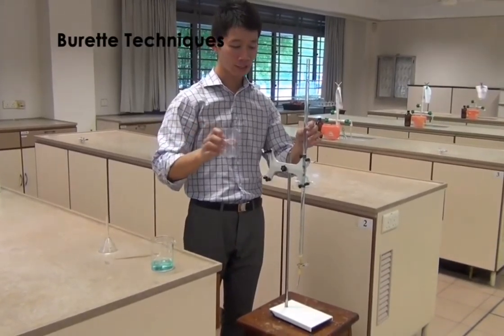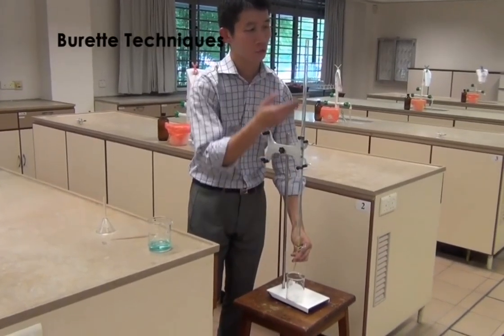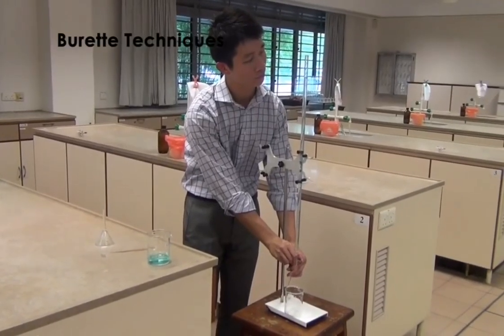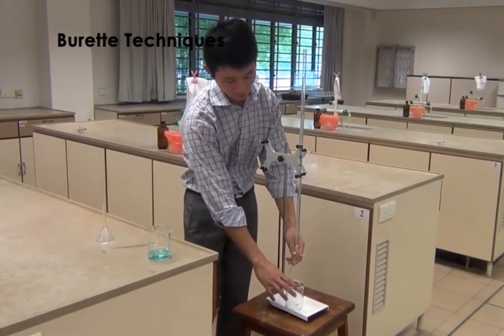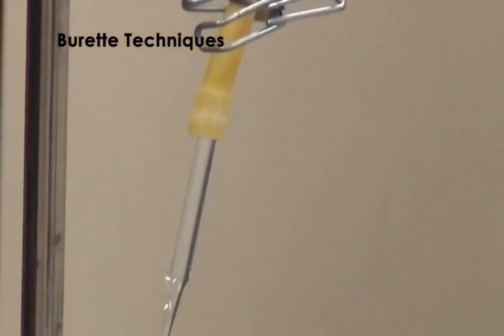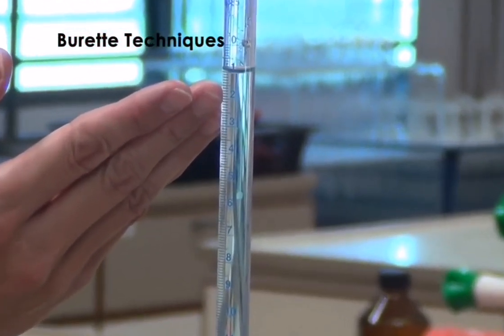Position the waste beaker at the bottom of the burette. Now, open the clip to empty the solution until a marking that you are comfortable to start the titration with. Once you are done, ensure that there are no air bubbles on the tip of the burette. Observe the solution level at eye level using the bottom of the meniscus as a guide. This will be the initial reading that you will record down for your burette reading.